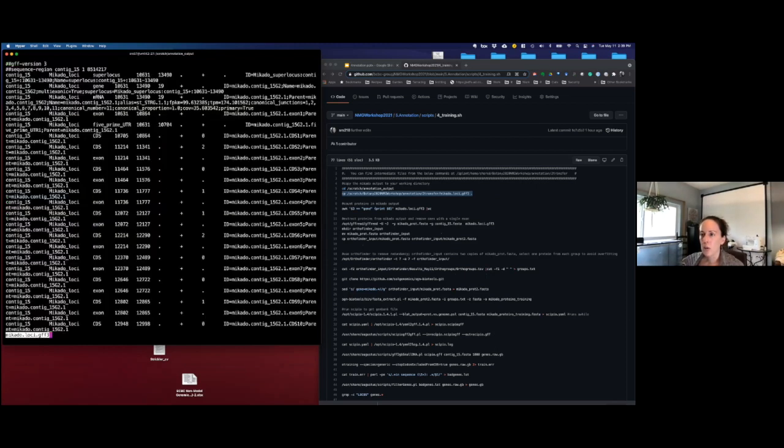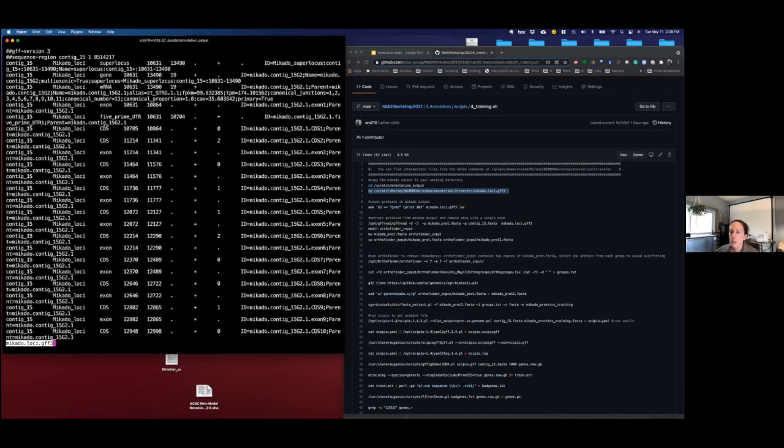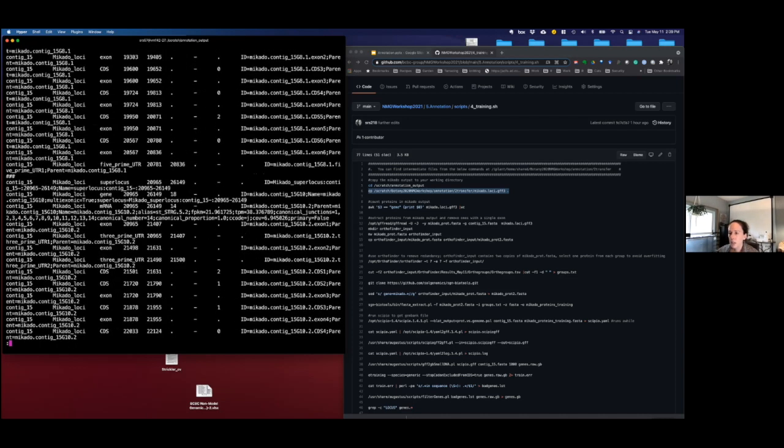All right, so you can see this has maybe a little bit more detail in it than the GTF from StringTie did. We have things arranged into genes now, and mRNAs, exons, we have UTRs. You're not going to have them for every gene, it just depends on what the data look like. And then coding sequences and exons.